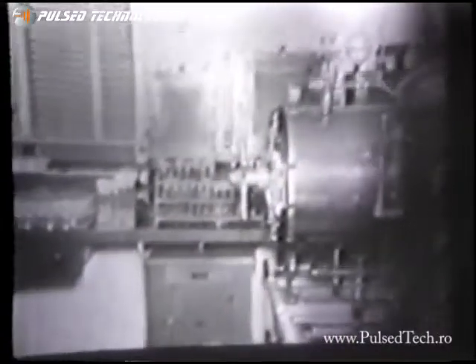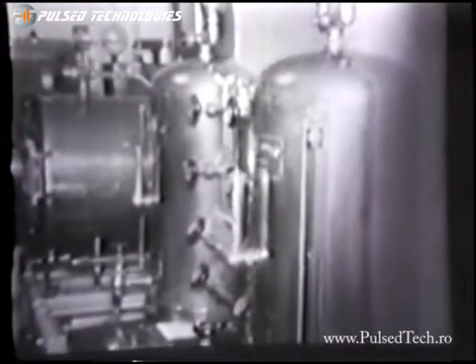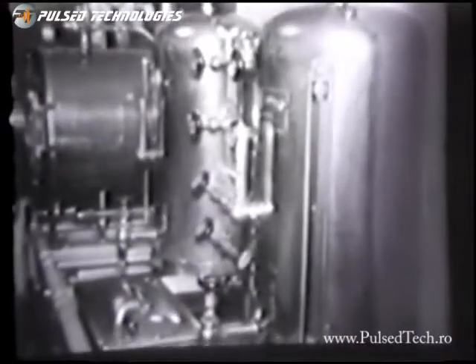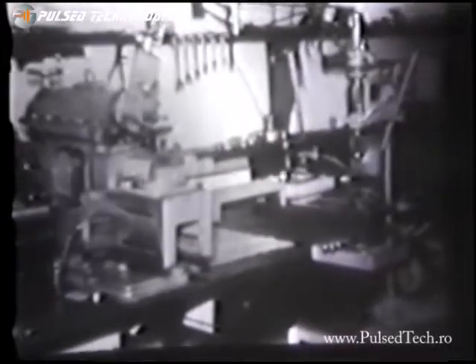This is the chemical apparatus of the laboratory, part of it. The cultures are in this cabinet, which had to be protected from the radiation of the electromagnetic energy developed by Rife's ray tube instruments. There were many sterilizers in the laboratory, one being 15 feet long for the sterilization of glassware and other research items. These are hot water steam heaters. There was a complete machine shop in the laboratory for tool work, making microscopes, and providing any of the facilities needed for the research.